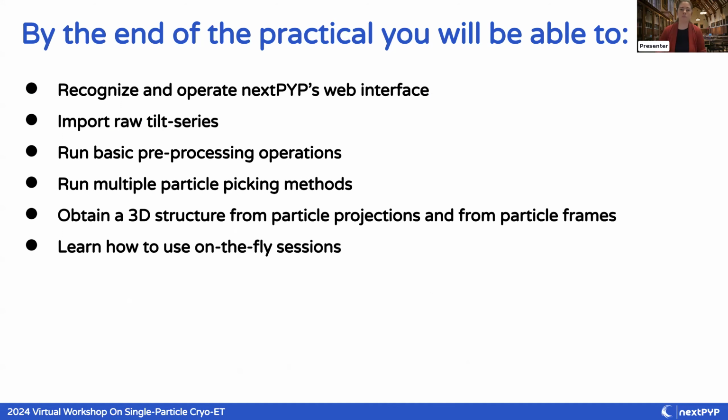And to reiterate, by the end of the practical, you should be able to recognize and operate nextPYP's web interface, import raw tilt series, run basic pre-processing operations, run multiple particle picking methods, and obtain a 3D structure from particle projections and particle frames. And outside this pipeline, you should learn how to use on-the-fly pre-processing sessions for data collection.